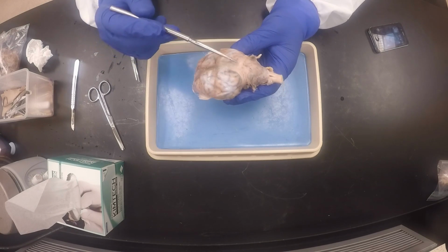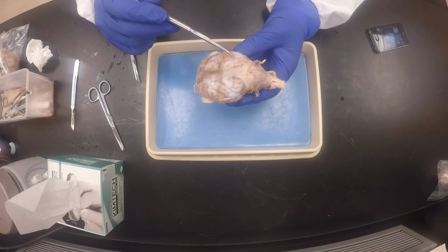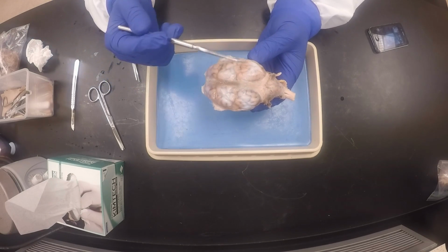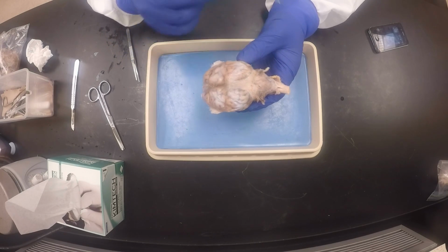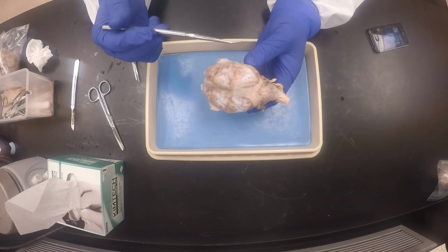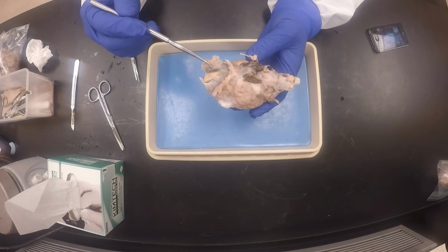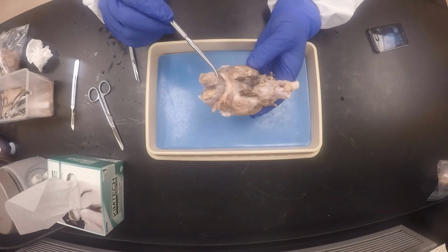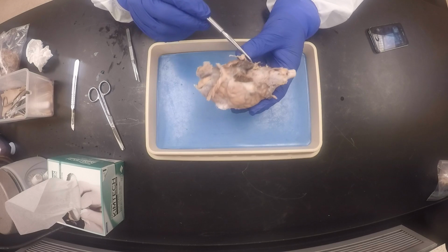So we're going to have to remove it. This is the hardest part of it. This is like a collar that holds the cerebrum up off the cerebellum here. So that's a tough part. We're going to make an incision to remove this. We make an incision like that, and then we cut off this tentorium cerebelli.